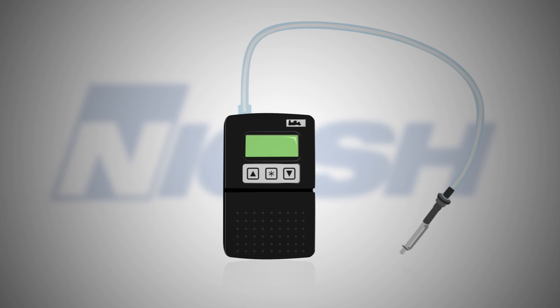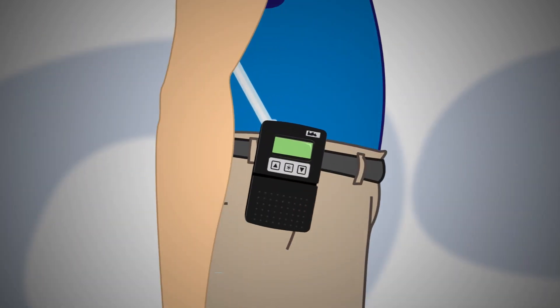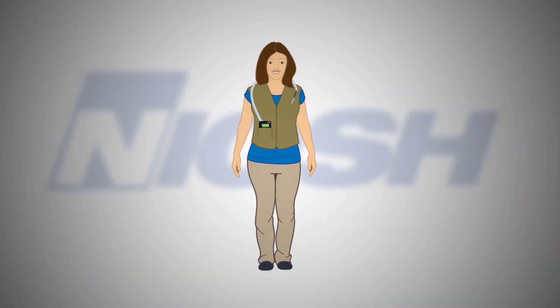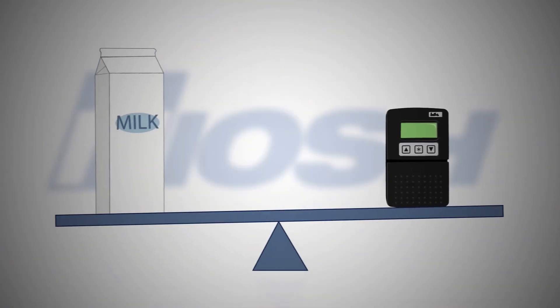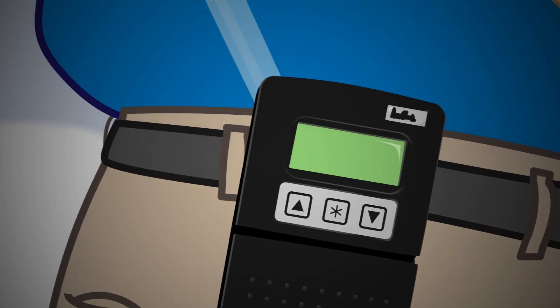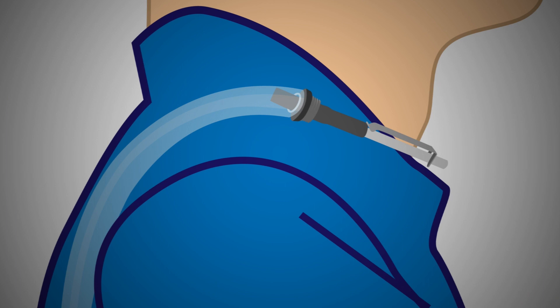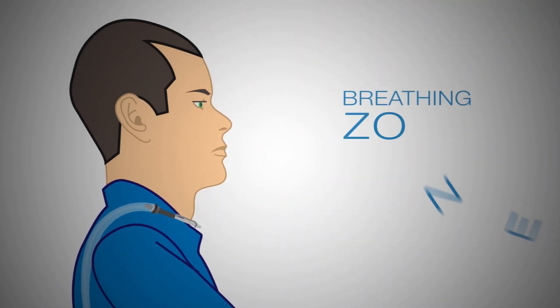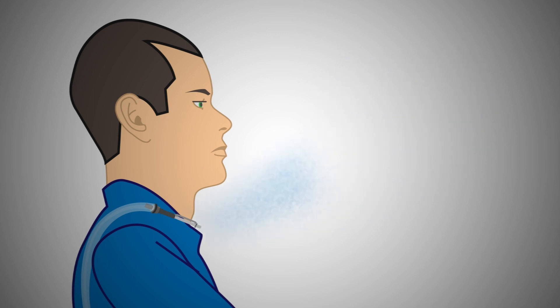The air quality sampler has three parts. The pump is a box-like device usually worn along the belt line or in a special vest. It weighs about the same as a quart of milk, but it is smaller and not as bulky. The train is a plastic tube connecting the pump to the cassette. The cassette holds the filter. We put the filter near your mouth, or as we call it, your breathing zone. The filter captures substances in the air that you are breathing.